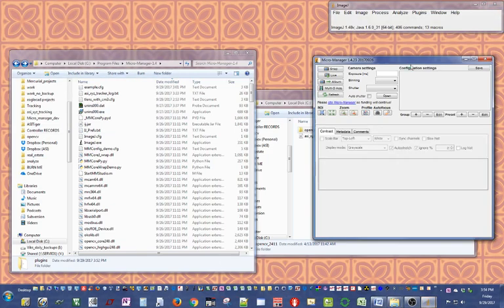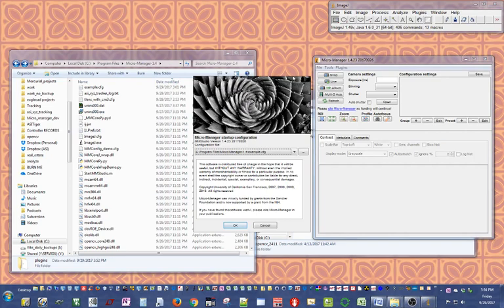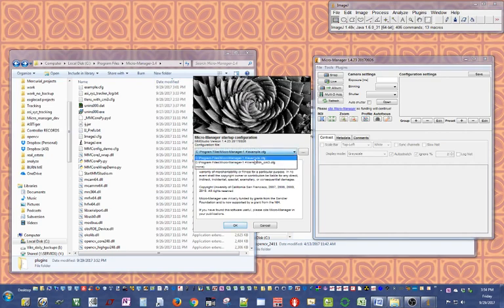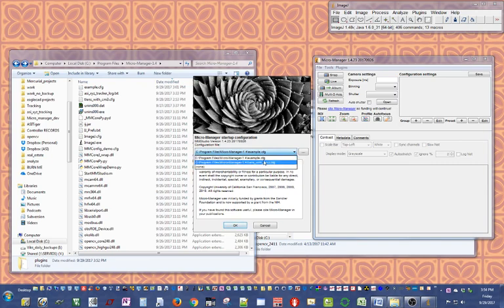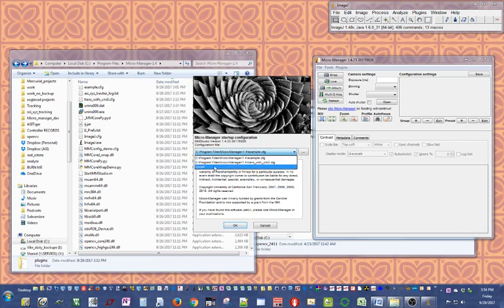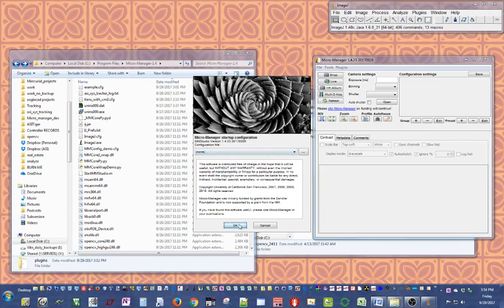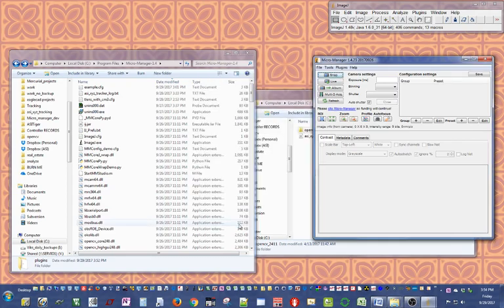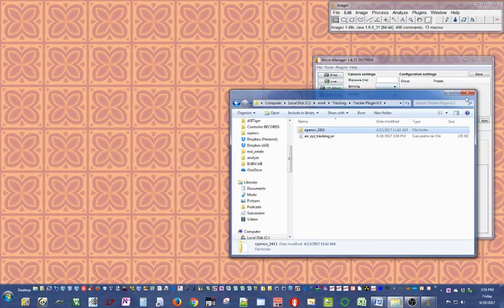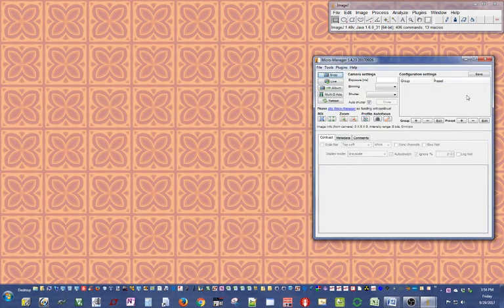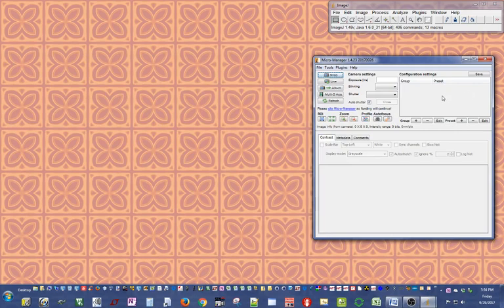MicroManager launches. If this is your first time running MicroManager, you probably don't have a hardware configuration file set up yet. In case you do, just select it and get started, but I'm going to show you how to generate a startup configuration. Select none for now and press OK.